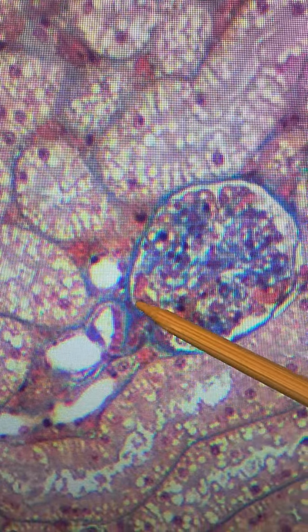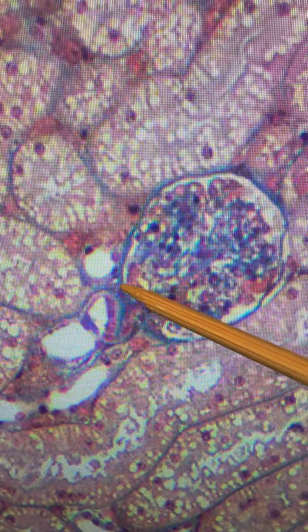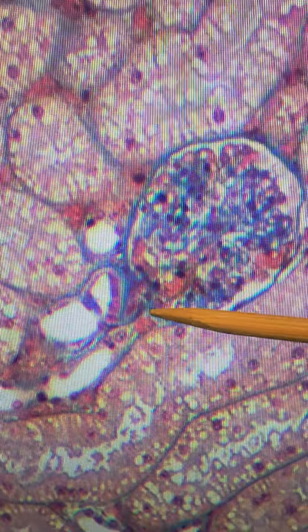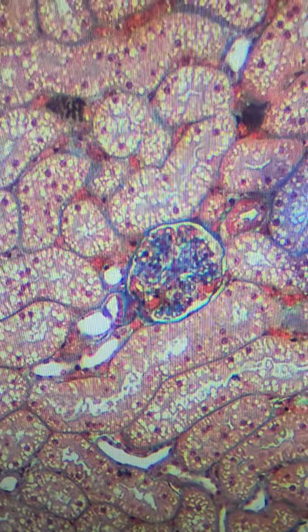And I want to pay close attention to this structure right here. This is actually a distal convoluted tubule, and you can see how the cells close to Bowman's capsule are enlarged. That's actually the macula densa. And then here we have the juxtaglomerular cells. I'm going to increase in magnification so we can get a clearer view.